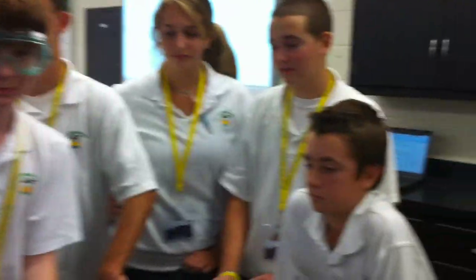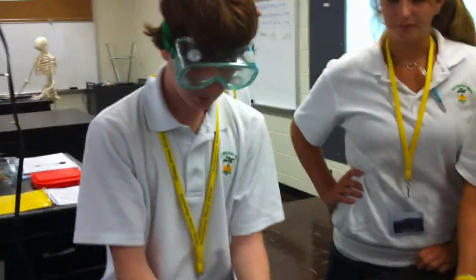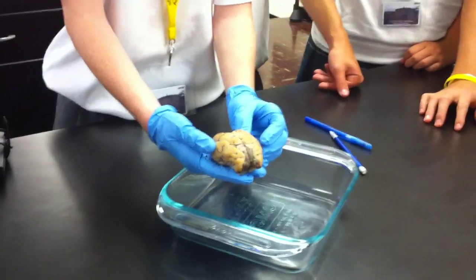Hi, we're at Archbishop Wood. We're in fourth, fifth period. And we're doing a brain inspection here.